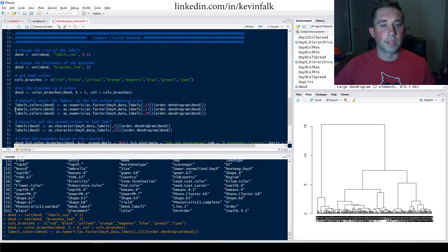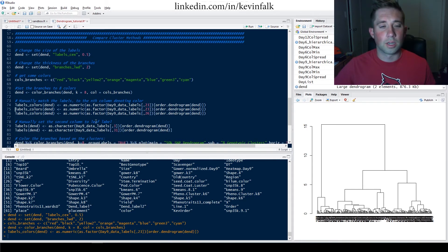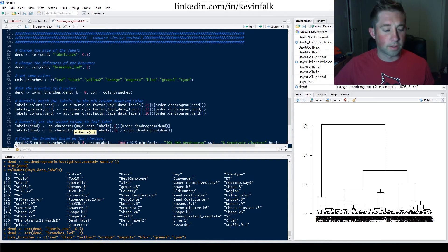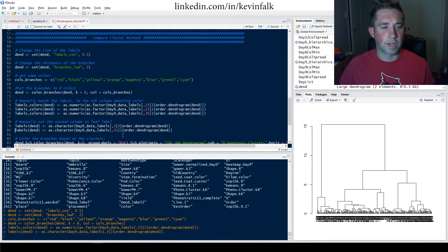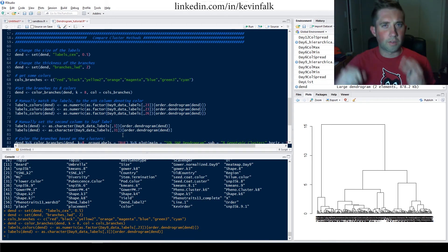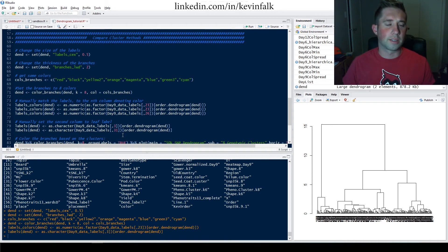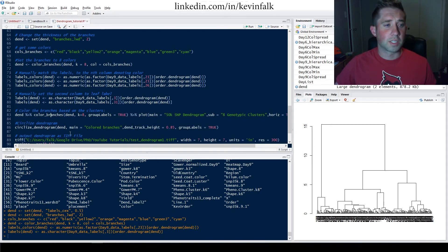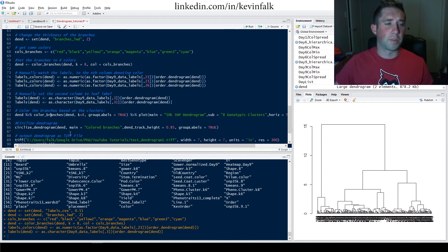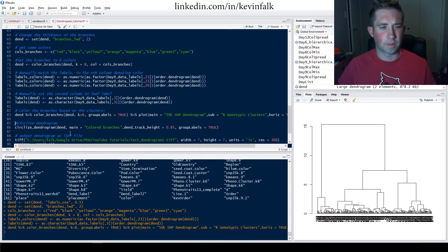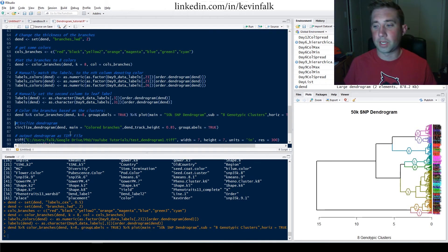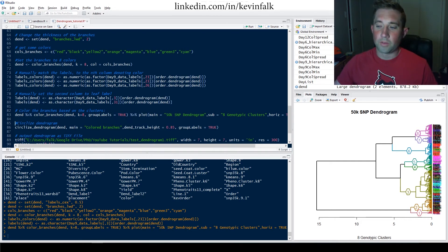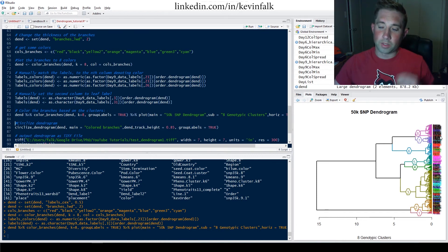This took me a long time to figure out and how to do it right. So now that I've set the numeric numbers, essentially the color of the leaves based on country, I can then set the leaf label based on some other factors. So here I have the name, I can set it as 31, what's 31, the flower color. So let's just set it as maybe the name for right now. So now I have all three variables set, the branch color, the leaf color, and the leaf label. Now I use this function using with some deployer with piping from one to the next to put them all together. And it'll build my dendrogram. So there we have it. We've got different colors of branches. We've got different colors of leaves, and we've got different labels in the leaves.